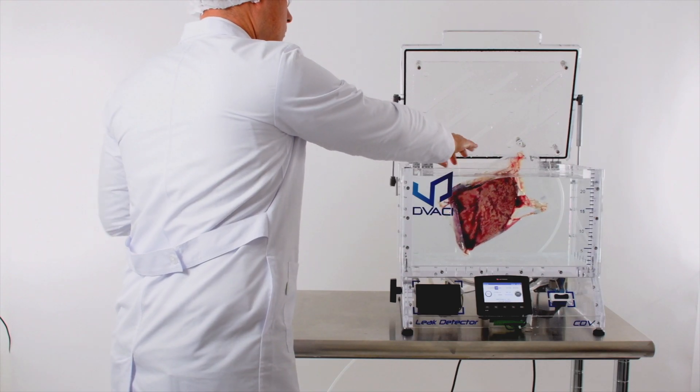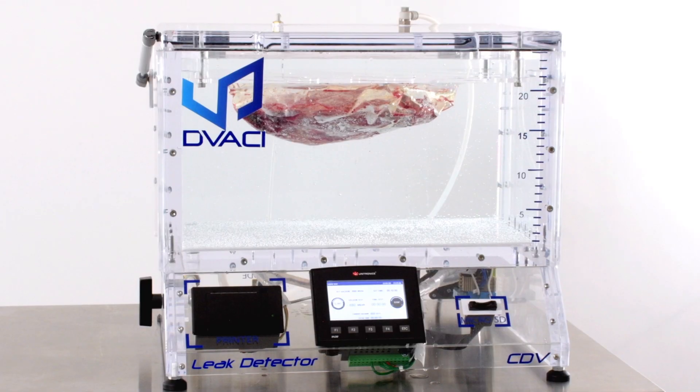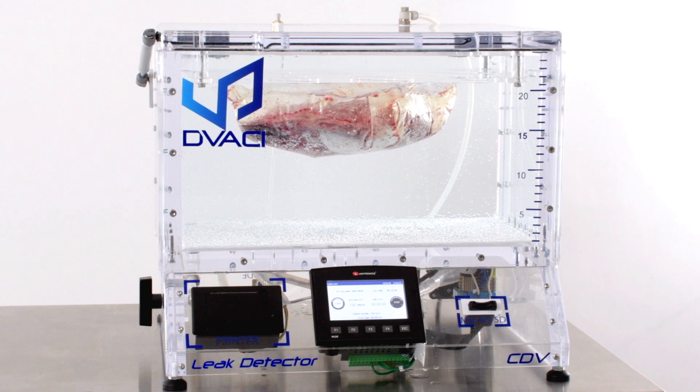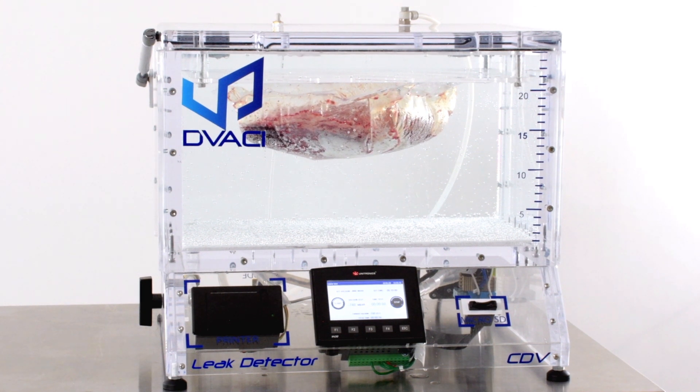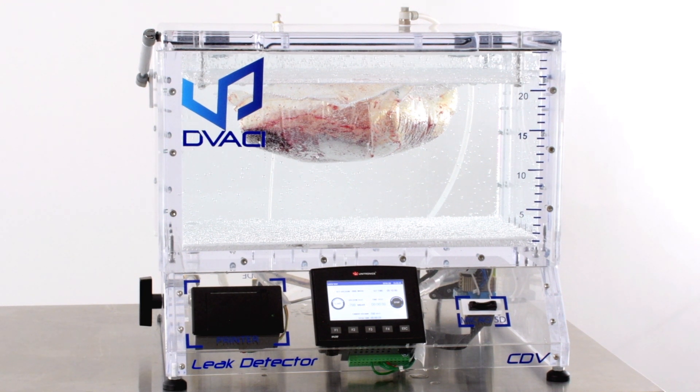In our first test, we will place the pack inside the chamber and apply vacuum. Notice this meat is preserved in vacuum packing, but it still has some air inside. The CDV leak detector is powerful enough to create greater vacuum in the chamber than the one inside this vacuum packed meat. If this air starts leaking out in the form of bubbles, that means the package has a leak and therefore has failed this test.